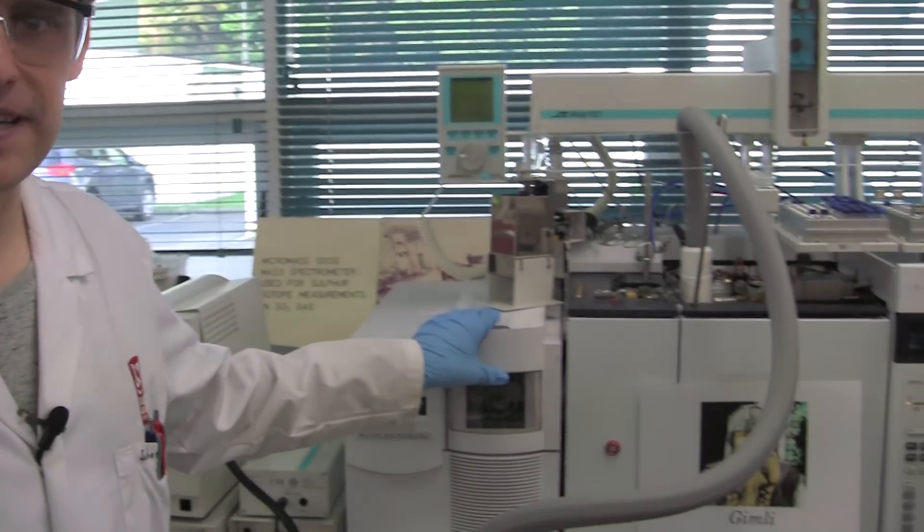And now I'm showing you a very different instrument which does basically the same as these plates. It is called a gas chromatograph mass spectrometer. Now imagine there are thousands of organic compounds in the environment. So many compounds that are not visible as our pigments. In such cases we can use such sophisticated instrumentation.